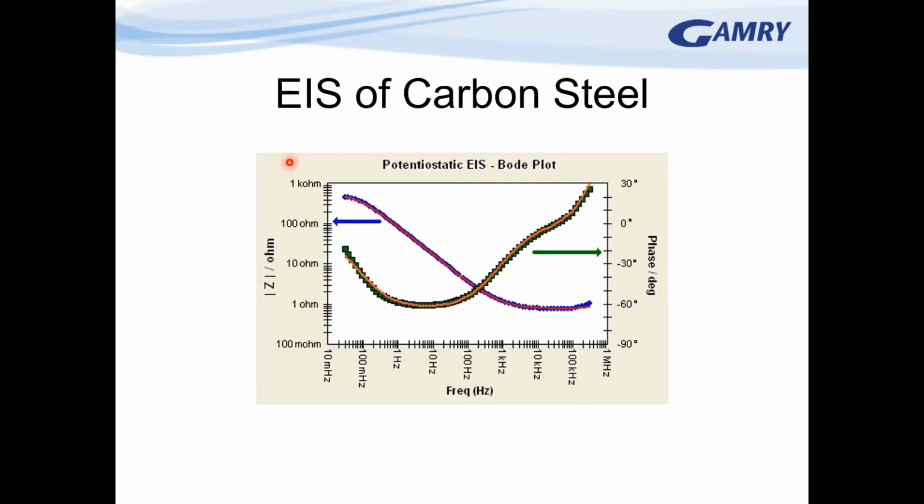Okay. Is there a particular advantage of EFM over these other techniques? As I pointed out, you can get the corrosion rate out directly without knowing anything about Tafel constants. So from that point of view, it does have an advantage.